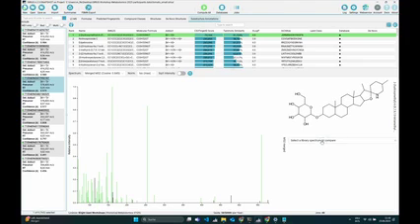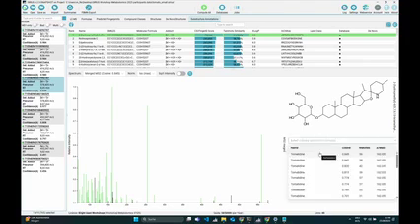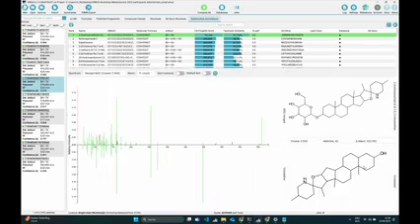And what you have now in this list, if you click on this, you don't have an exact hit, but some hits have a high cosine score, about above 0.8, and which have this delta mass, which means we don't have an exact hit, but an analog hit where we have some mass difference. And if we select some of these examples, let's just take this one.